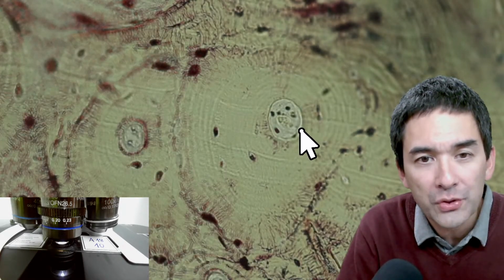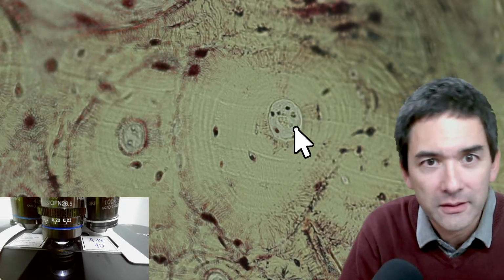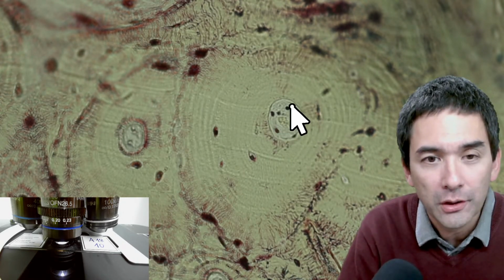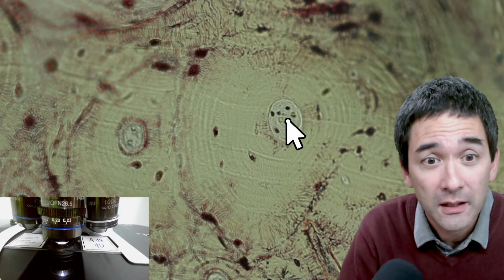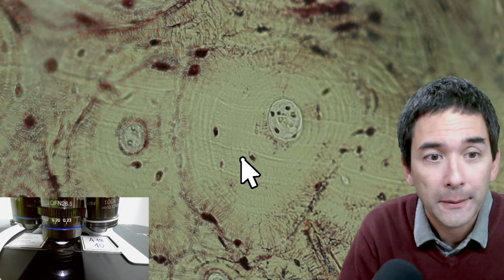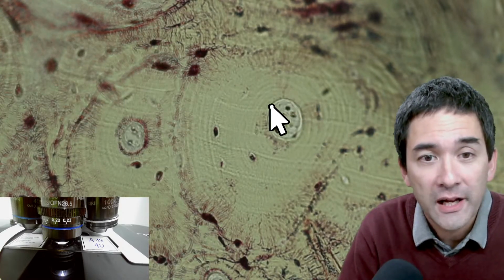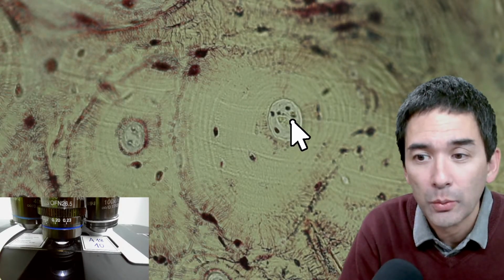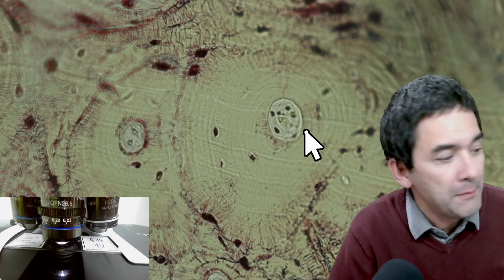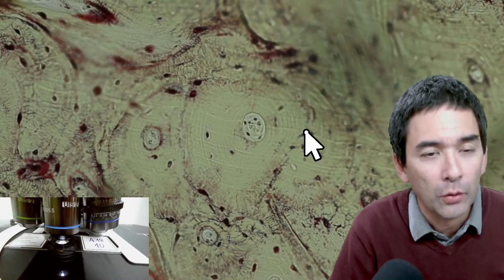But I think one of the important things here is that a bone, of course, it's kind of obvious, but it makes it clear here, is a living structure. Bone has to grow, obviously. And this means that there have to be cells inside the bone. And of course there has to be blood supply as well. And this is basically what we see here. This is already pretty high magnification. It's 60 times, but let's go down a little bit so that you get a better overview.